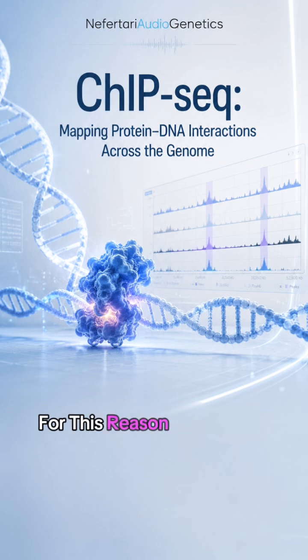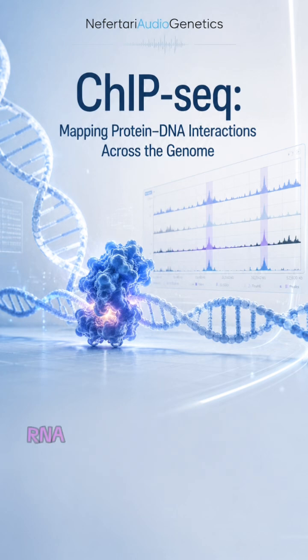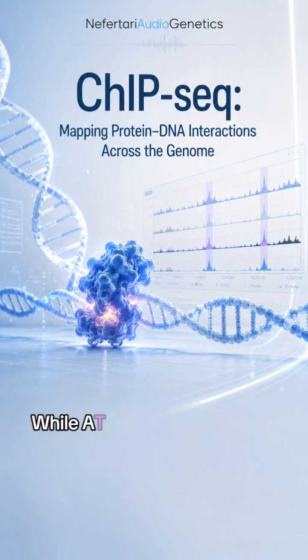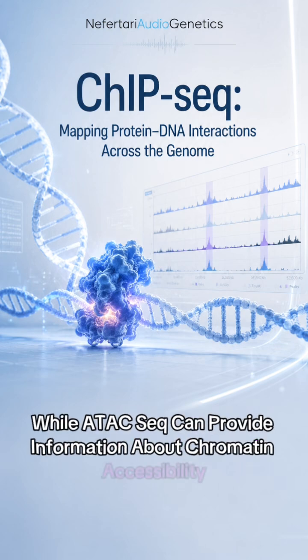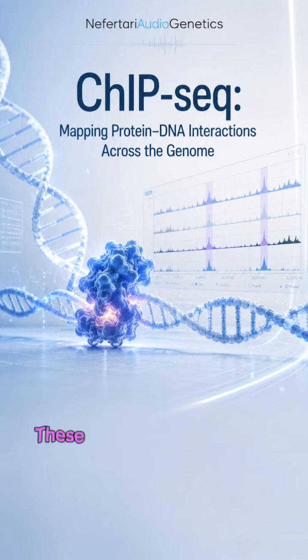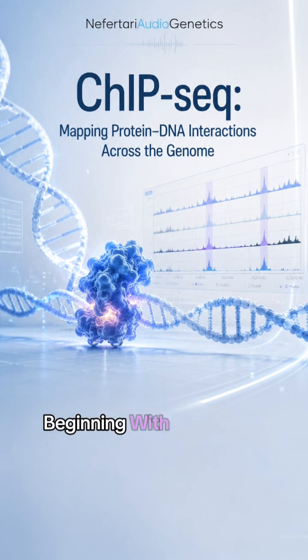For this reason, ChIP-seq is often integrated with complementary approaches. RNA-seq can reveal changes in gene expression, while ATAC-seq can provide information about chromatin accessibility. Together with functional validation experiments, these approaches can help connect regulatory proteins, chromatin states, and transcriptional output.